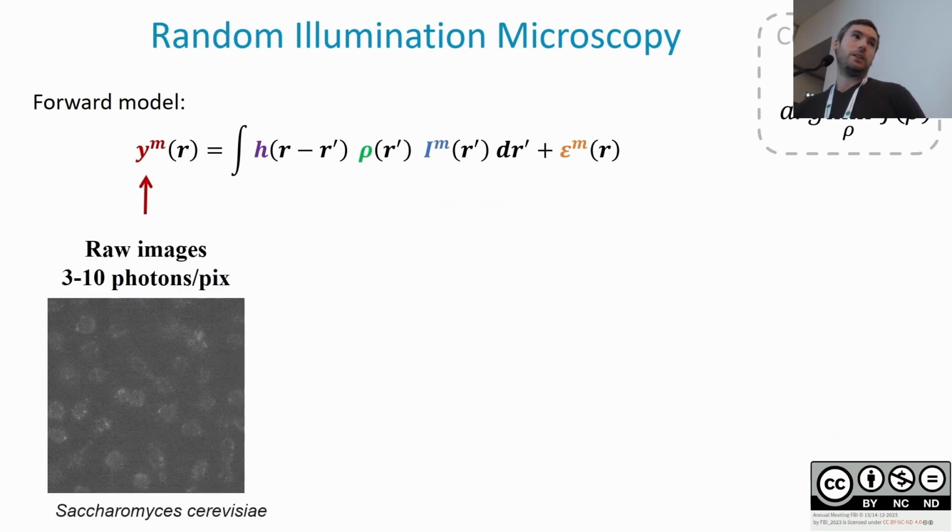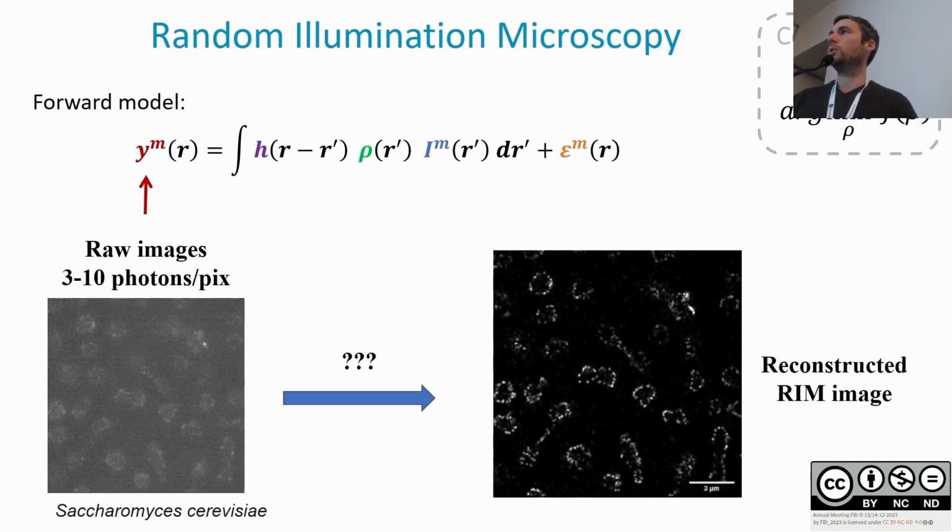And finally, the images. We have really bad quality images, but we combine multiple of them. So if you take one of these images, it's only a few photons per pixel. The fluctuation is what matters to us. And it's what we will use to calculate a super resolved image. And typically, we use between 50 to 200 of these images to create one reconstruction like that.